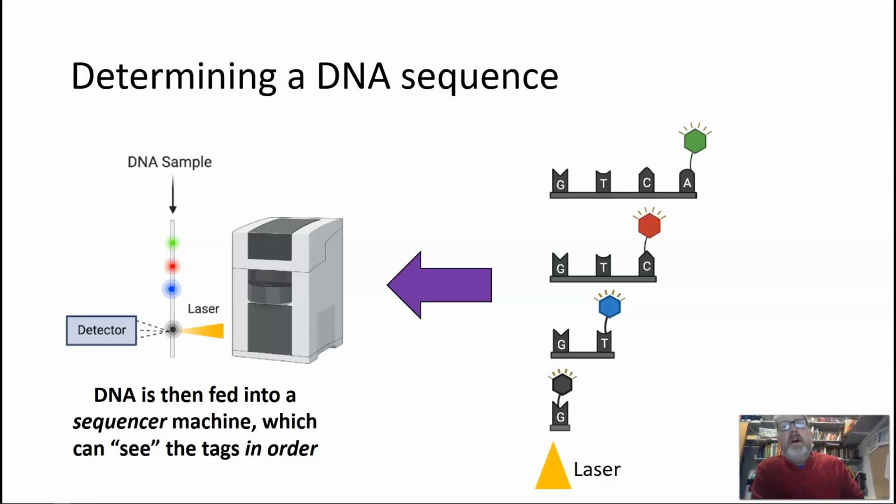All right, so what they do is they run PCR, and there's a mix of both regular bases and these special fluorescent bases. So the polymerase will go along the sequence and make copies until it accidentally grabs one of these fluorescent bases and puts it on there. Because the fluorescent bases are different, the polymerase will pop off of that sequence, right? It'll fall off right there, right?